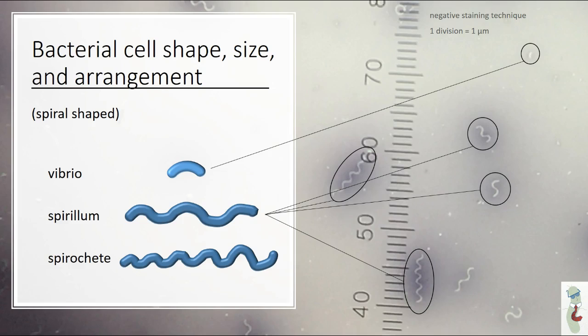This bacterial smear doesn't contain spirochetes, but I'll show you a moving spirochete in the next couple minutes. In all 3 cases, the curved bacteria only form single-cell arrangements. Their lengths vary, with the Vibrio being the shortest and the spirochetes being the longest. The bacteria in this slide is an example of a Spirillum ranging from 2 to 7 micrometers in length and are very thin, less than a half a micrometer in width. So that pretty much covers the most common cell morphologies that you'll encounter.